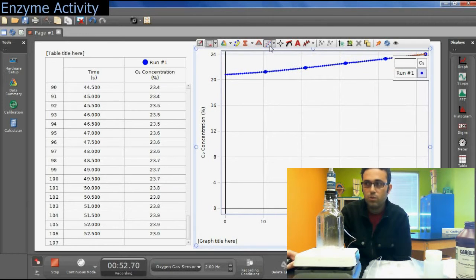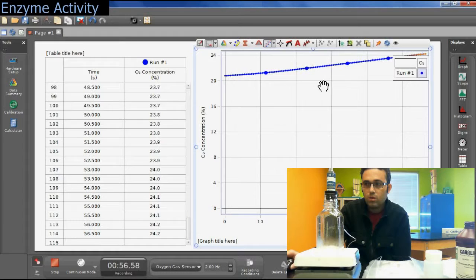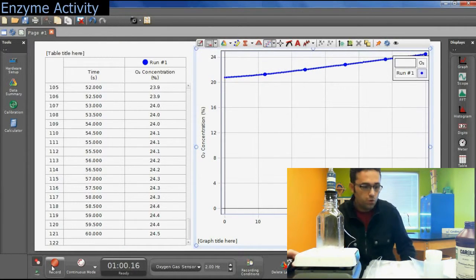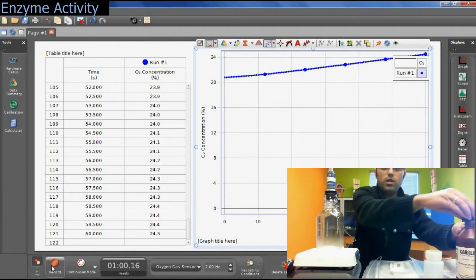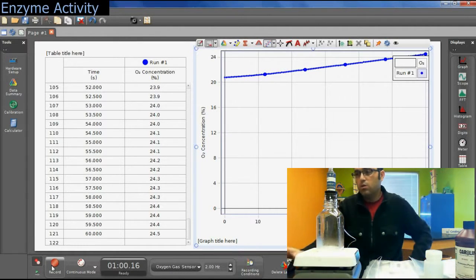I mean, the software will give it to you easily, like it will calculate it for you, but it will not calculate it for you in the exam. So once you get your graph, get your best fit line using the software, and then make your calculations using your own graph.